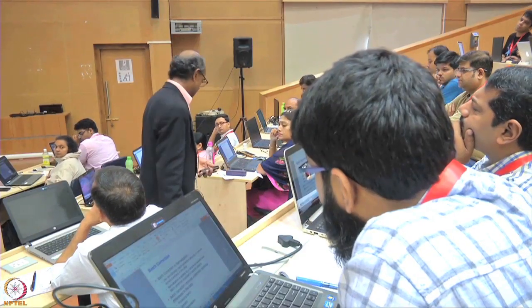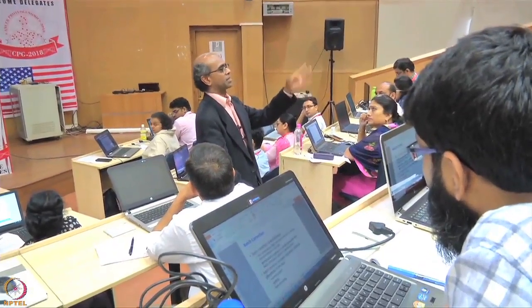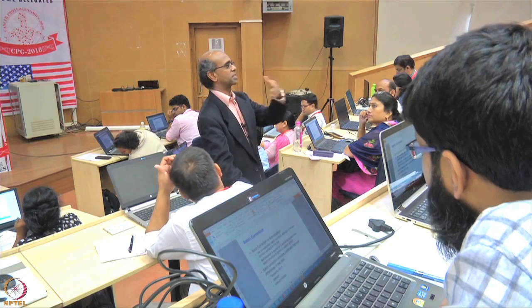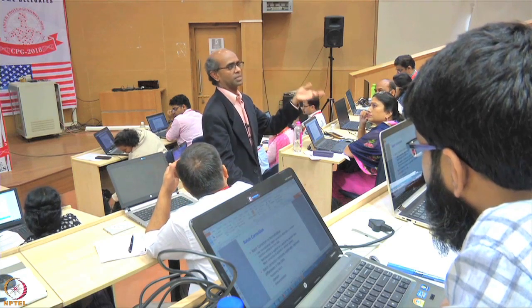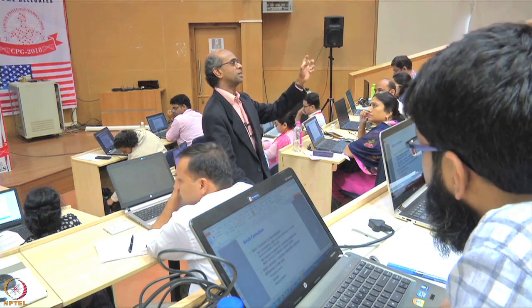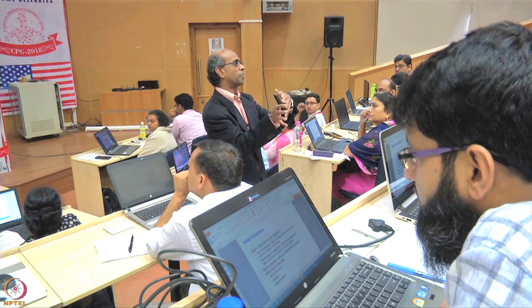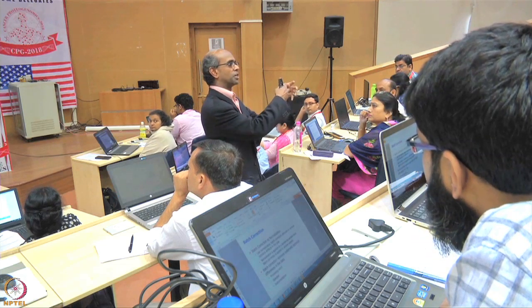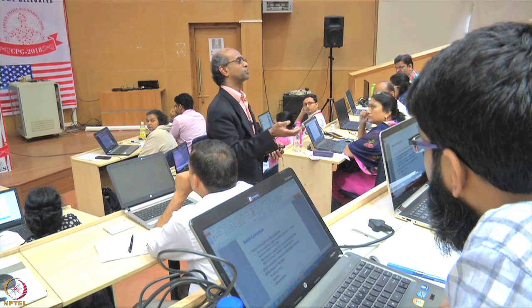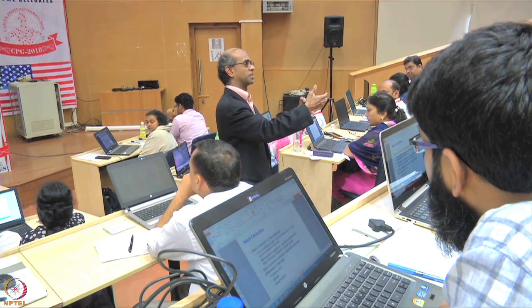If the question is whether a protein was different between type A and type B, like cancer versus normal, you do it 3 times and you see the same difference. In that case, you probably don't need batch correction because all you're doing is ratios of cancer to normal in the same batch. But if you have 3 replicates, your statistics will be much more robust. So you can combine all the 3 replicates to find out which proteins are different.